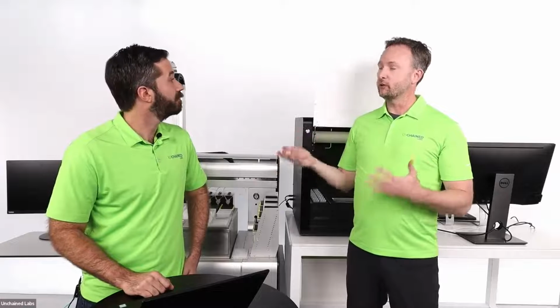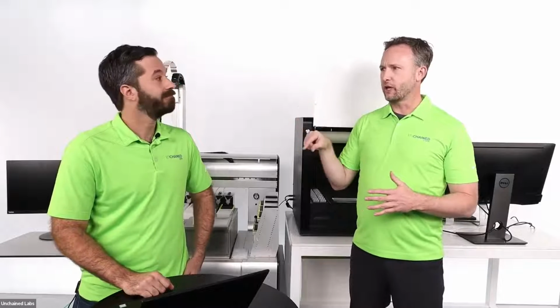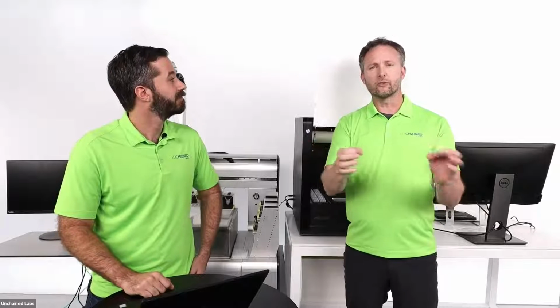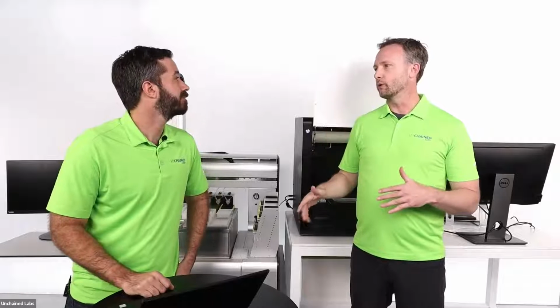Now, if there's a case where that's not going to happen, keep in mind, Big Tuna and Unagi prioritize your sample recovery, or making sure that your samples are not lost. So the worst thing that will happen is it will run long. Something I forgot to mention is there is a feature on both instruments where you can pause your run when some of those samples are done, and then take out those faster flowing samples, and then the overall run will finish quicker. Oh, okay, cool.